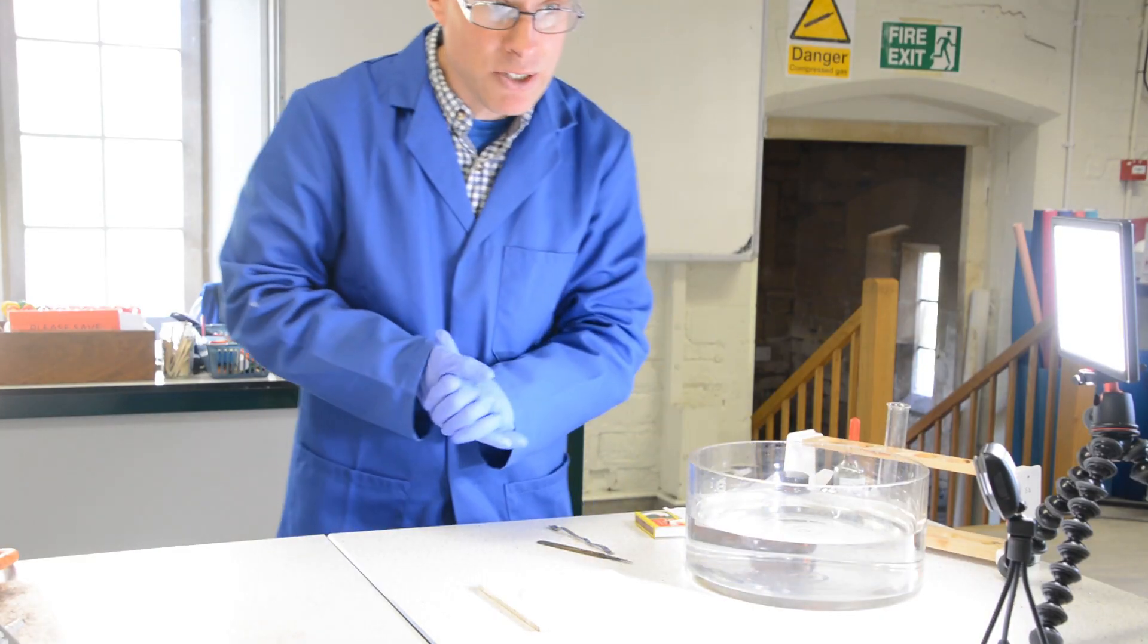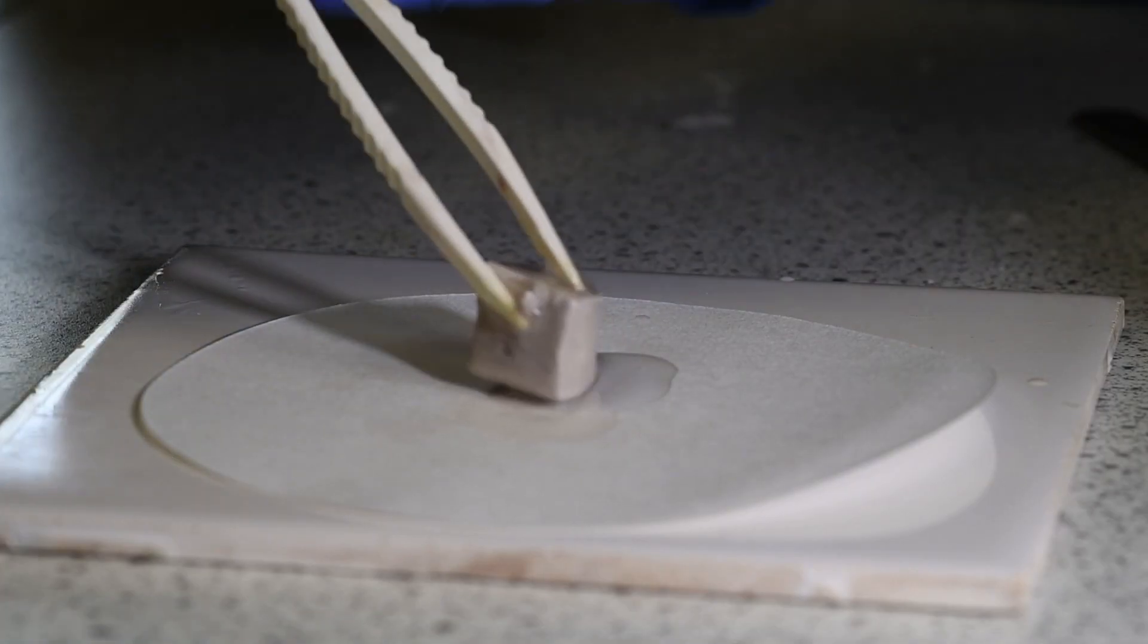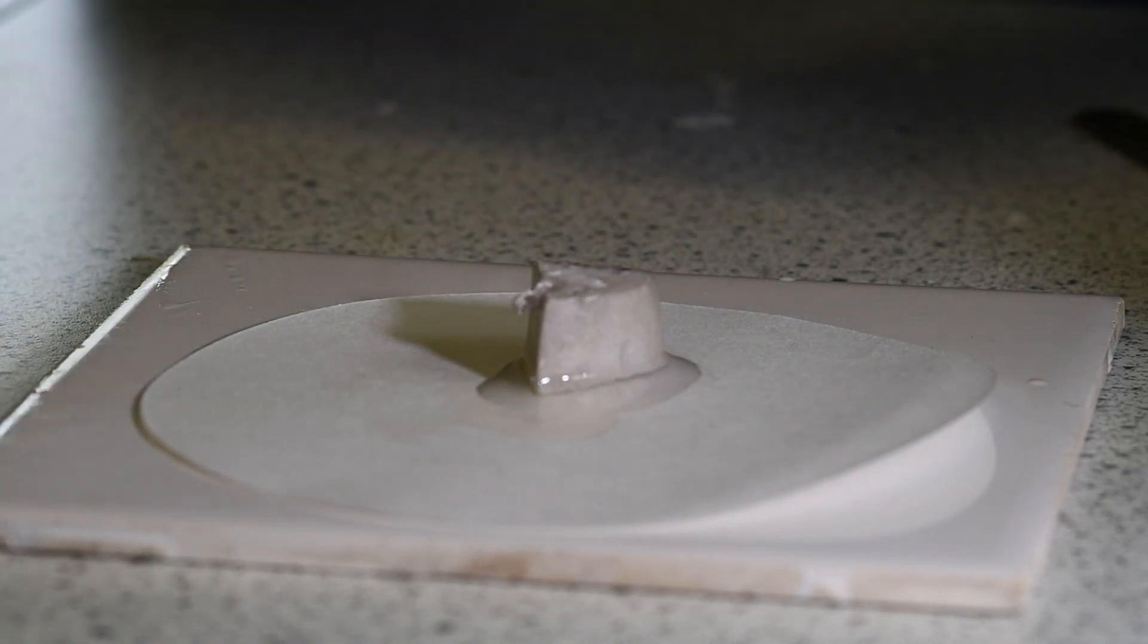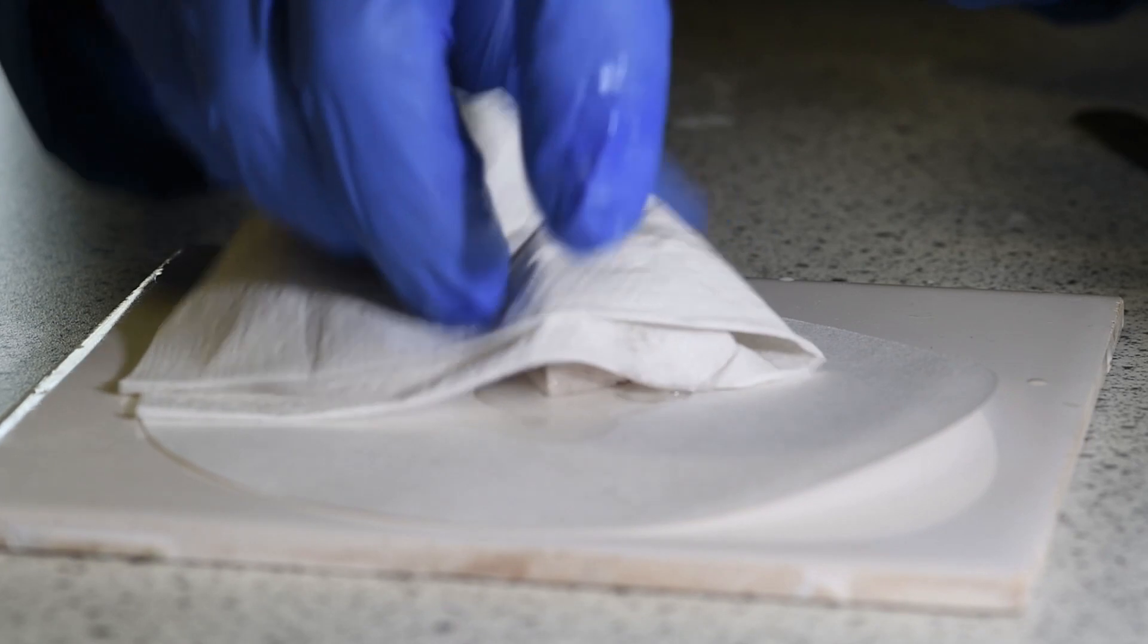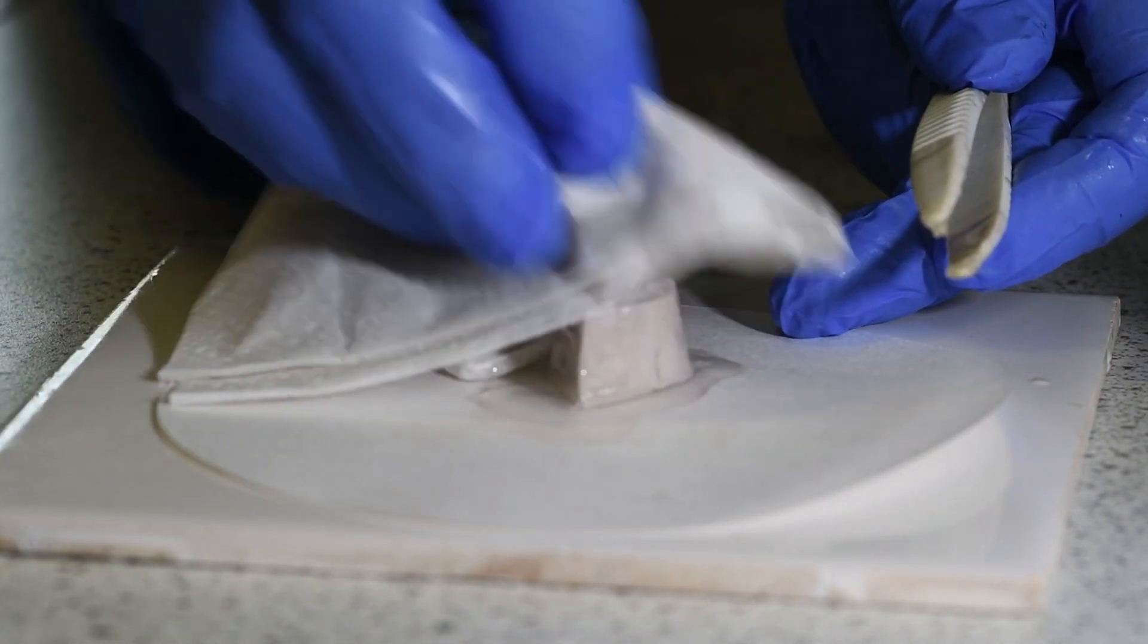The second metal that we're going to have a look at is sodium. There's a big piece of sodium. Again, you can see all that oil over the surface. I'll just dry some of that oil off.